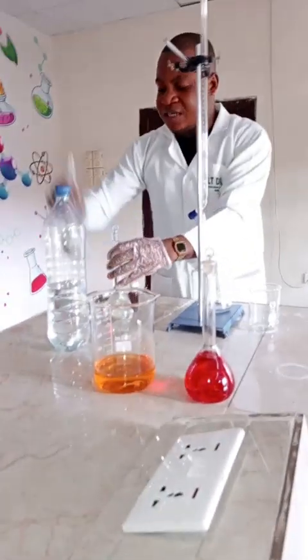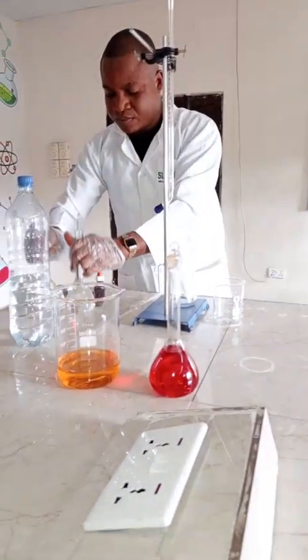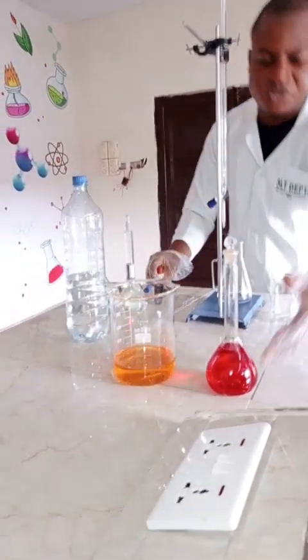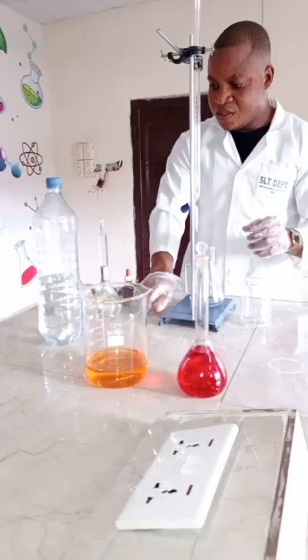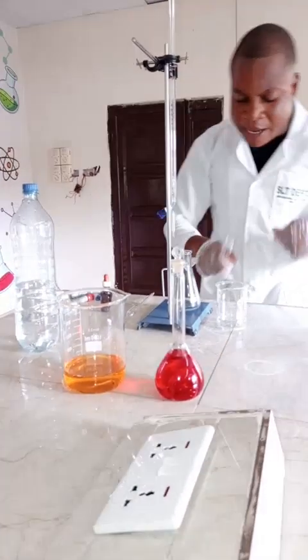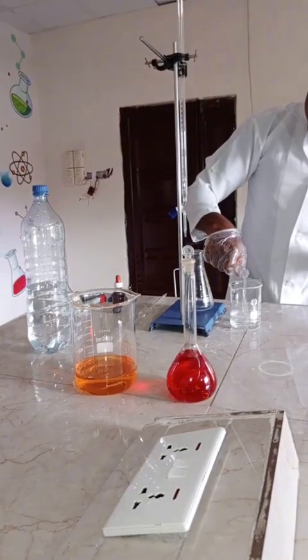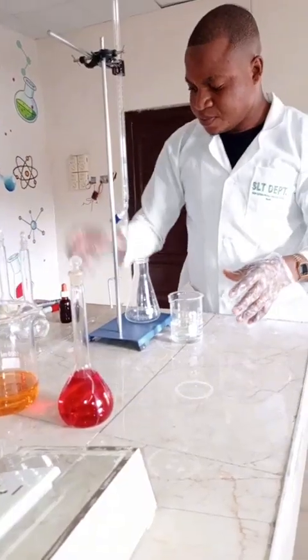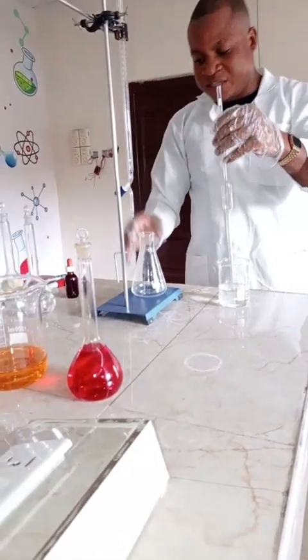I've told you before, this is our HCl, our acid, this is our base, and our indicator, material. This is my stock solution from that. Now, this is my base. I'm going to prepare 25 ml of the base. Enable me to turn it into my beaker for easy pipetting. I'll pipette 25 ml of the base.